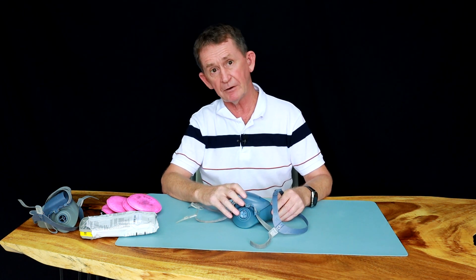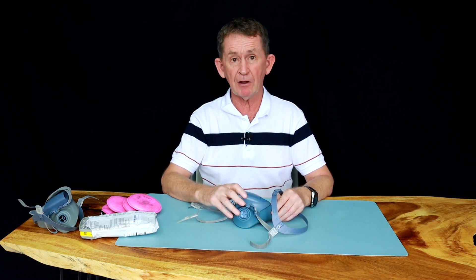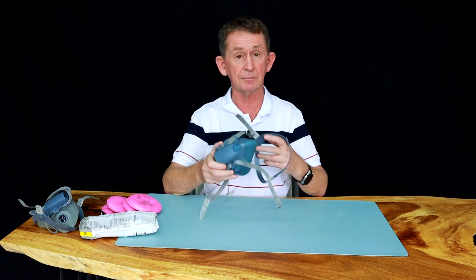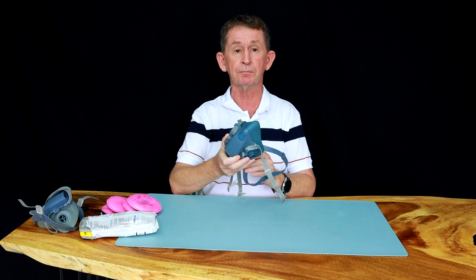There's also a 7501 and a 7503. The 7501 is small, 7503 is large, and this is medium. This one will fit most people.